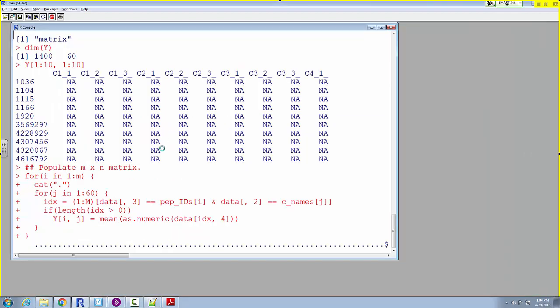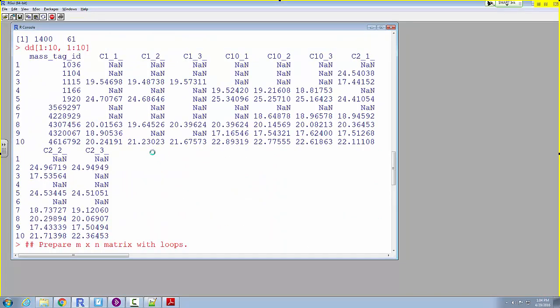If I come back up here and look at what came out when we applied the two reshaping functions, lots of missing values. So if I came to this peptide, for example, peptide 4, and I wanted to ask, are you different between healthy and diseased? If we popped that into something like t.test, we would have a problem because of these NAs. T.test is easy to deal with NAs. There's just an option where you can say remove any NAs. We could do a t-test in this case using only the observed numbers and just ignore the NAs.